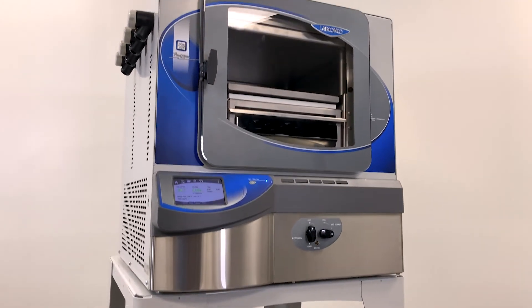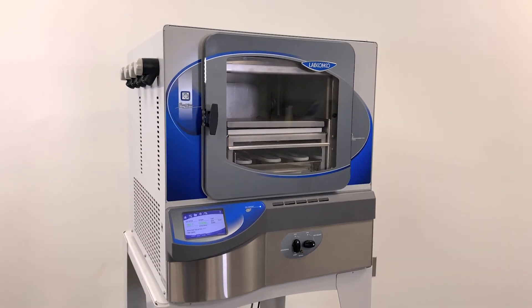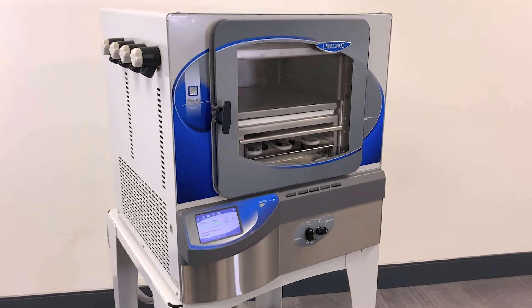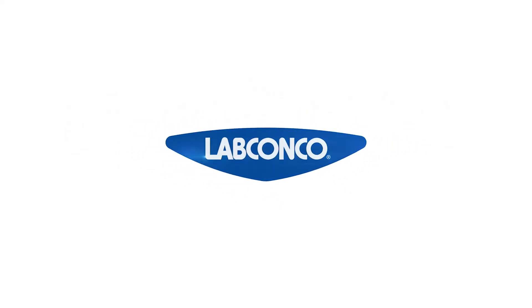This system is perfectly compact and designed with conveniences and flexibility to meet your freeze drying needs today and in the future. To learn more about LabConco Freezone Triad freeze dryers, visit labconco.com or contact one of our application specialists today.